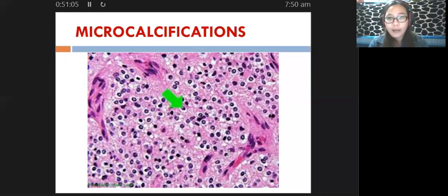So when you cut sections from your tissue block, there is resistance to your knife. Parang ang hirap niyang i-cut. Okay, there is resistance to your knife. There is a gritty texture that you would be able to observe. In Tagalog, parang mangingilo ka pag nagka-cut ka. I hope Miss Naide, you know the term ngilo. I think the English term is gritty. There is a gritty texture to it.